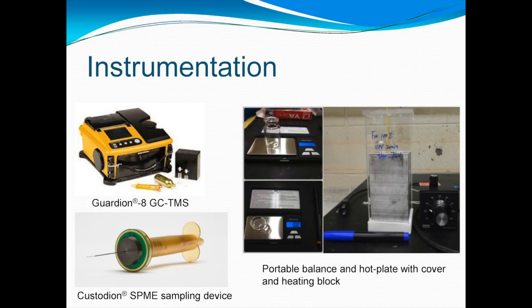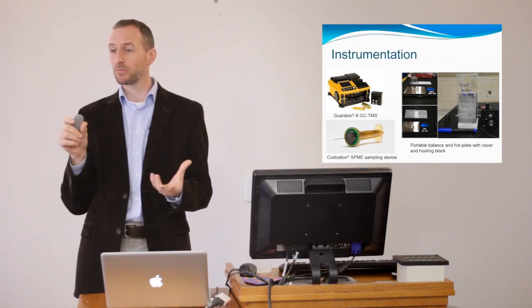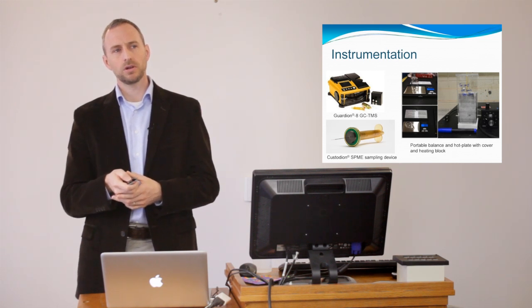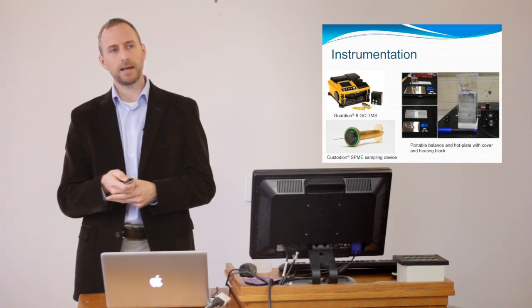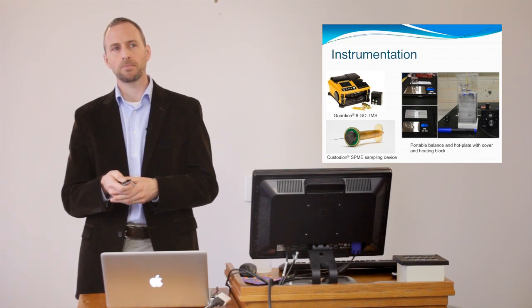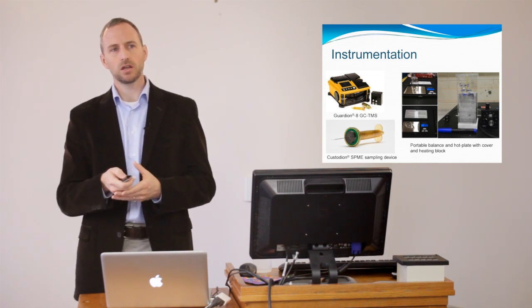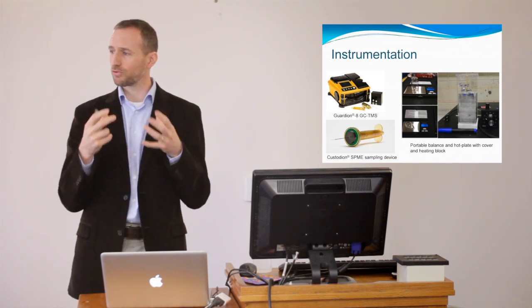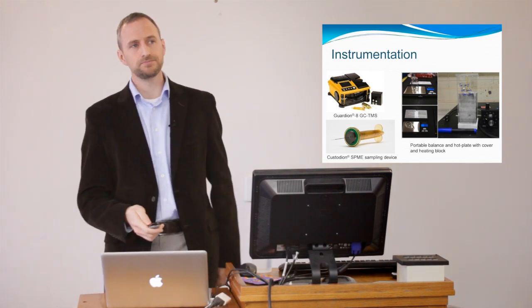One of the aspects we've had to develop to go along with this instrument is a way of extracting these PCBs from the soil in the field on site. And to do that, we've come up with this portable balance, just a battery-powered balance for measuring the mass of the soil, and then just a heating plate that's surrounded by this Pyrex insulator, really, to stop the wind cooling the sample too much. There's an aluminum block inside to help keep the temperature constant, so that when we do the extractions we can control the temperature very well and help make the extractions very reproducible.